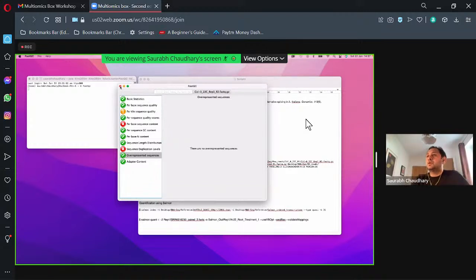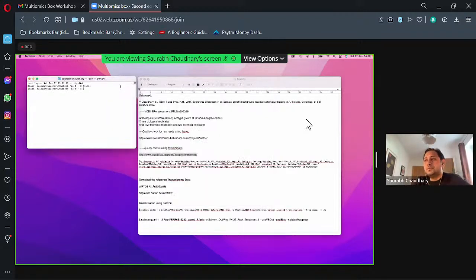And if you close that FastQC files, so now what is the next step? Once you have a contamination for that adapter, or your raw sequence is not good quality, you are going to perform Trimmomatic, which you can download from here as well as from Bioconda. And this is the command line, which I will give you. You just need whatever sample names you are using. You just replace the name of this sample with your sample and you perform the analysis.